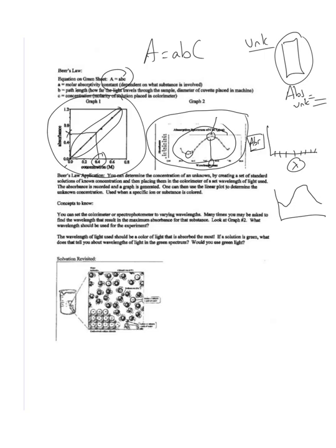another, maybe a second substance which is a different color, and you chart its wavelength. So you have two different wavelengths on this machine. And they could say, what wavelength would I want to utilize to determine the black line, but not the red? What frequency or wavelength of light would I want to utilize that would be used best to confirm the amount of whatever the black line material is, maybe it's copper.